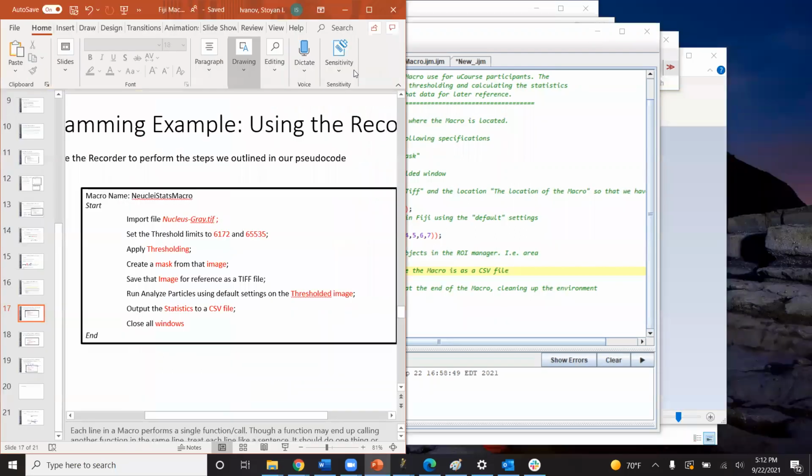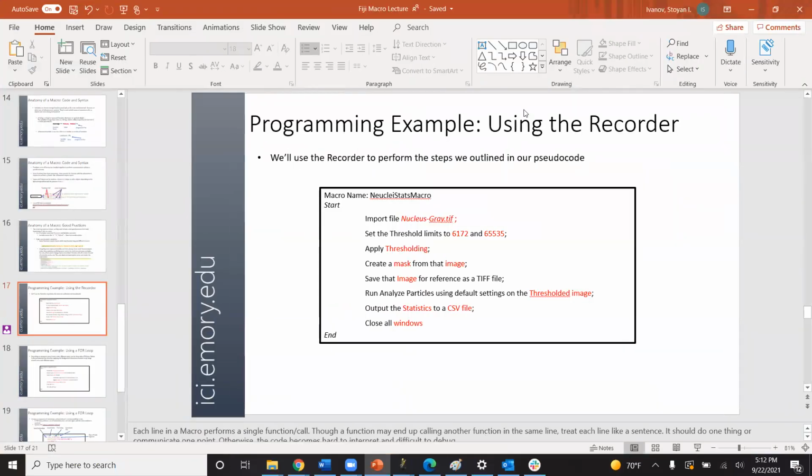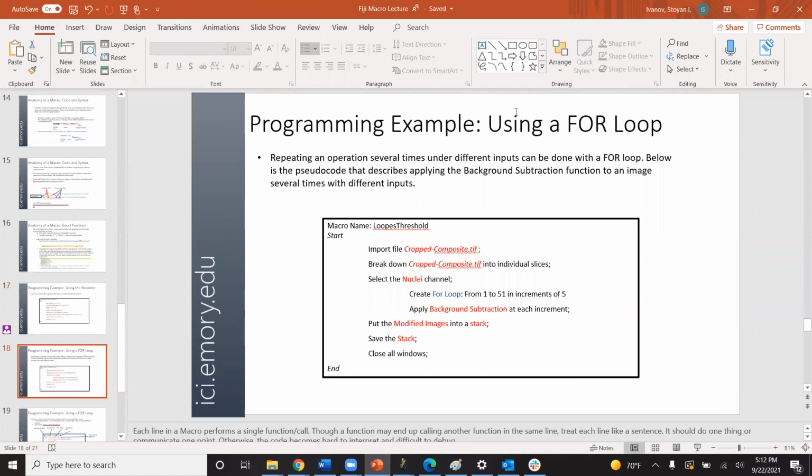Right, now we'll get familiar with the for loop. Now, what's a for loop? As I started explaining, it is basically a little batch of code that you run over and over again with different inputs or on different data sets. And I've got an example of that as well with your data for today's course.